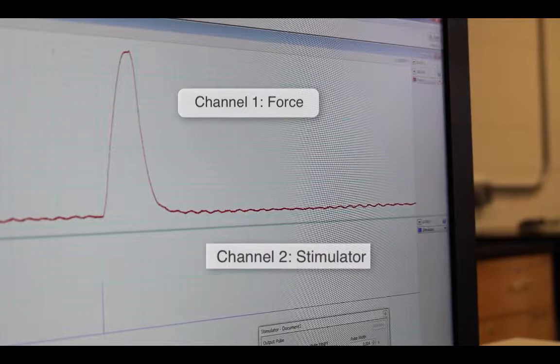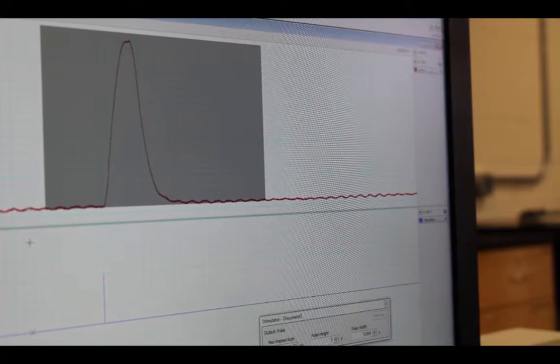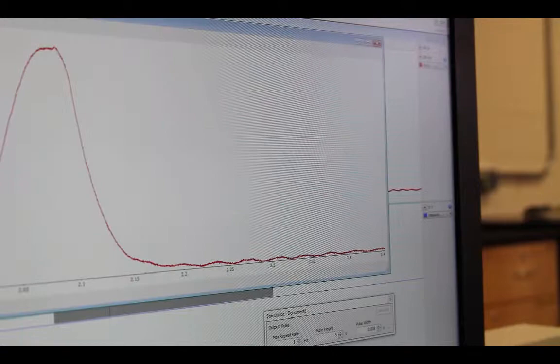Muscle is stimulated and recorded at high speed, and so to analyze a single muscle twitch at this high speed, we overlay the two channels and observe these in the zoom window where we can then make measurements.